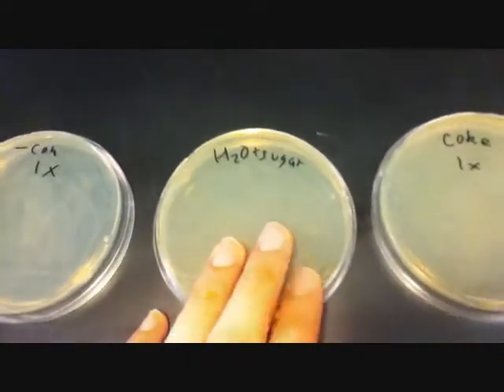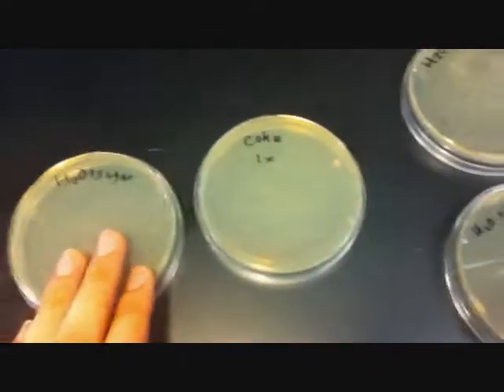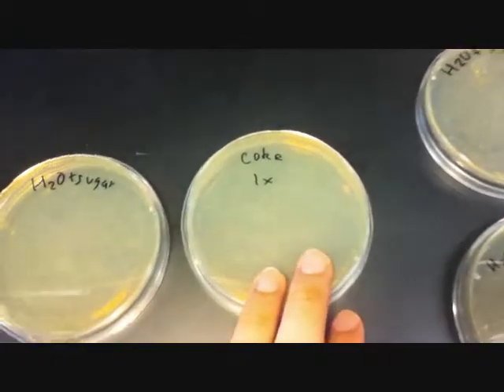Then this is the H2O plus sugar, which actually did worse than the H2O itself. Then the Coke, which was more acidic. And then these two: H2O plus sugar plus HCl, and H2O plus HCl.